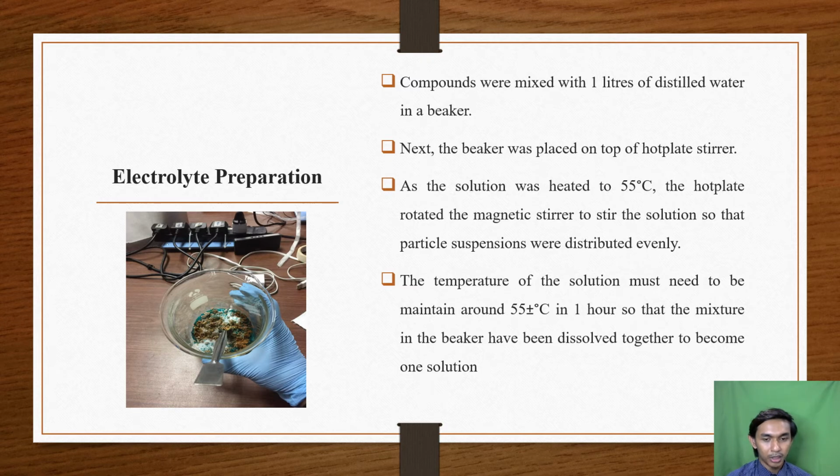The temperature of the solution must be maintained around 55 plus or minus degrees Celsius for 1 hour so that the mixture in the beaker has dissolved together to become one solution.